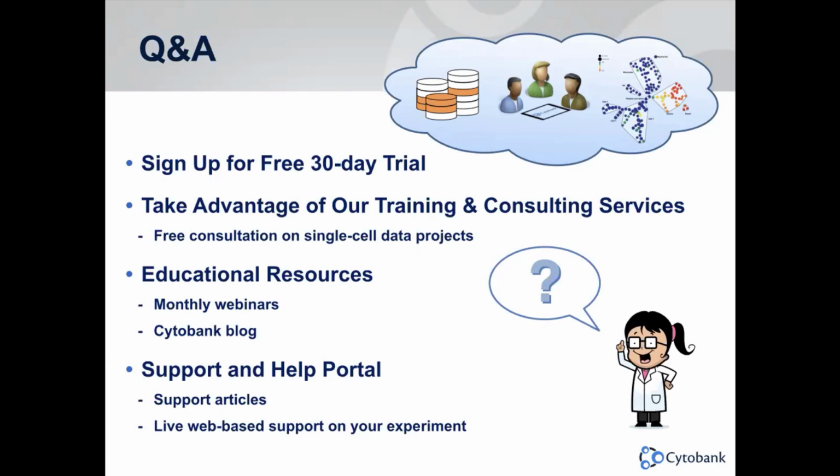Great. We do have another question for Cytobank. He said, I'm a new grad student and the only person in the lab doing high-dimensional flow. Does Cytobank have education promotion for individual students?